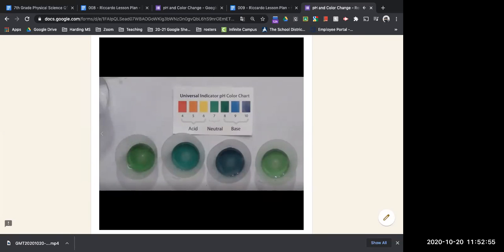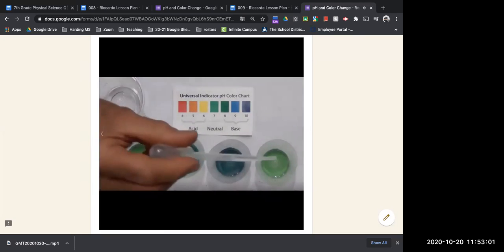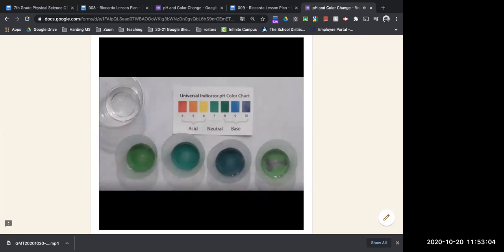Finally, more sodium carbonate is added to the water. This will be our most concentrated sodium carbonate solution. 1 drop of this most concentrated sodium carbonate solution is added to the cup on the right. What is the pH of the solution in the fourth cup?